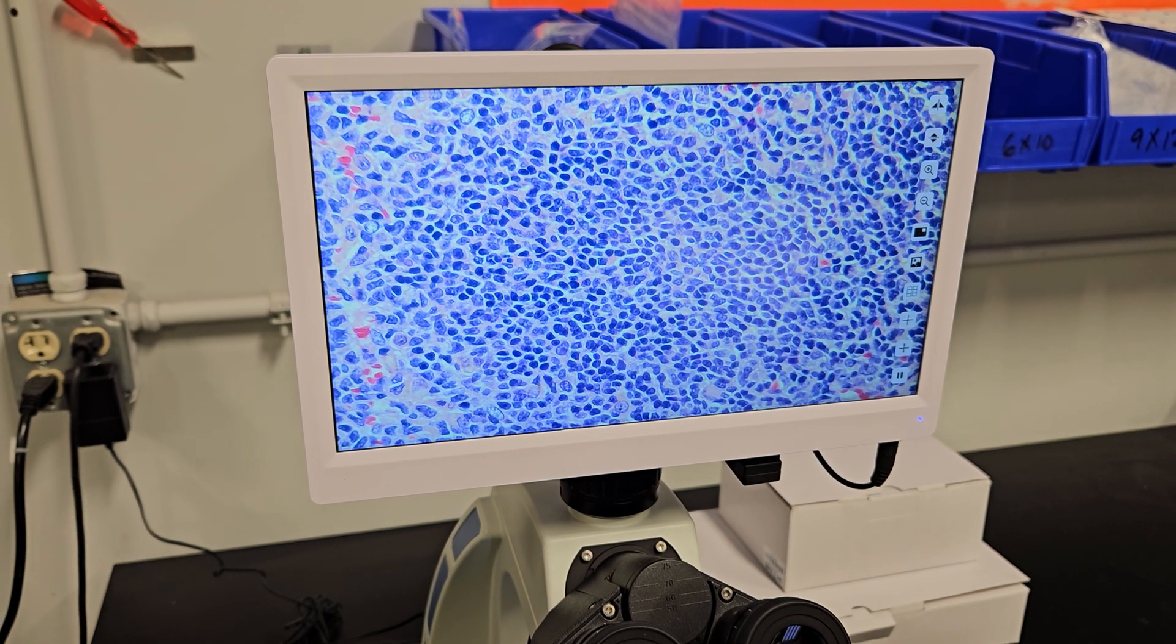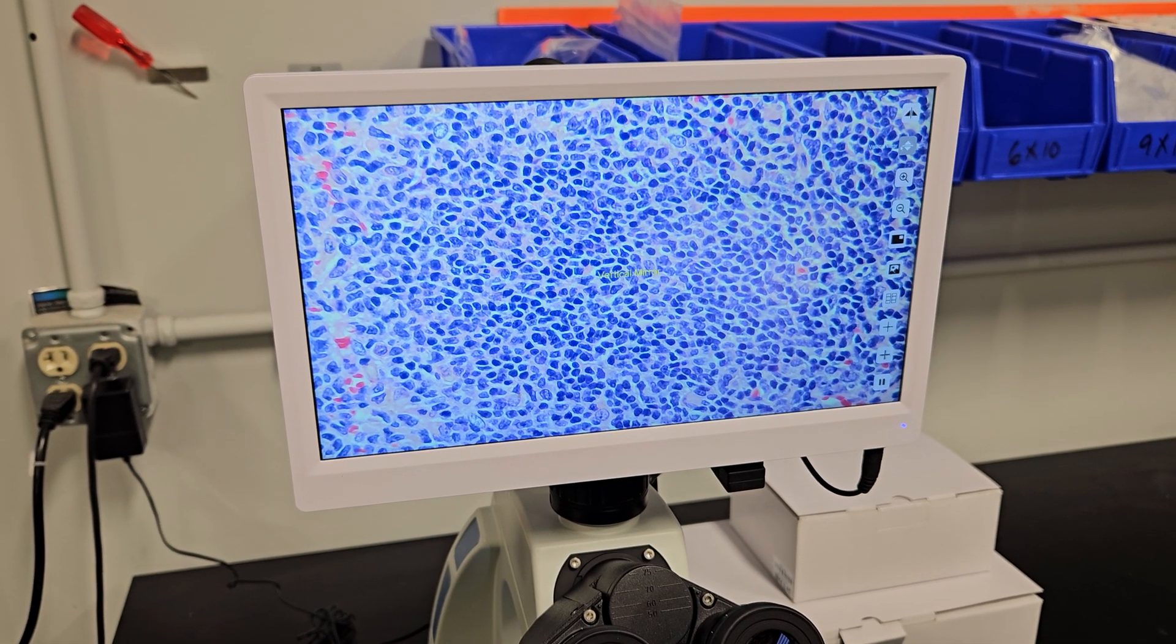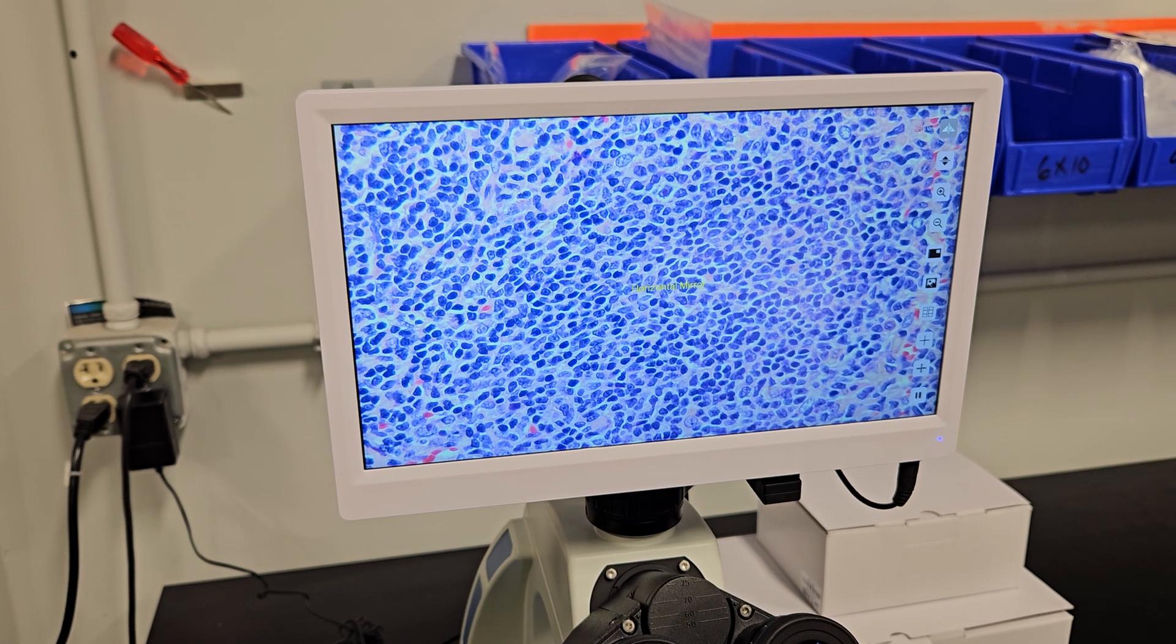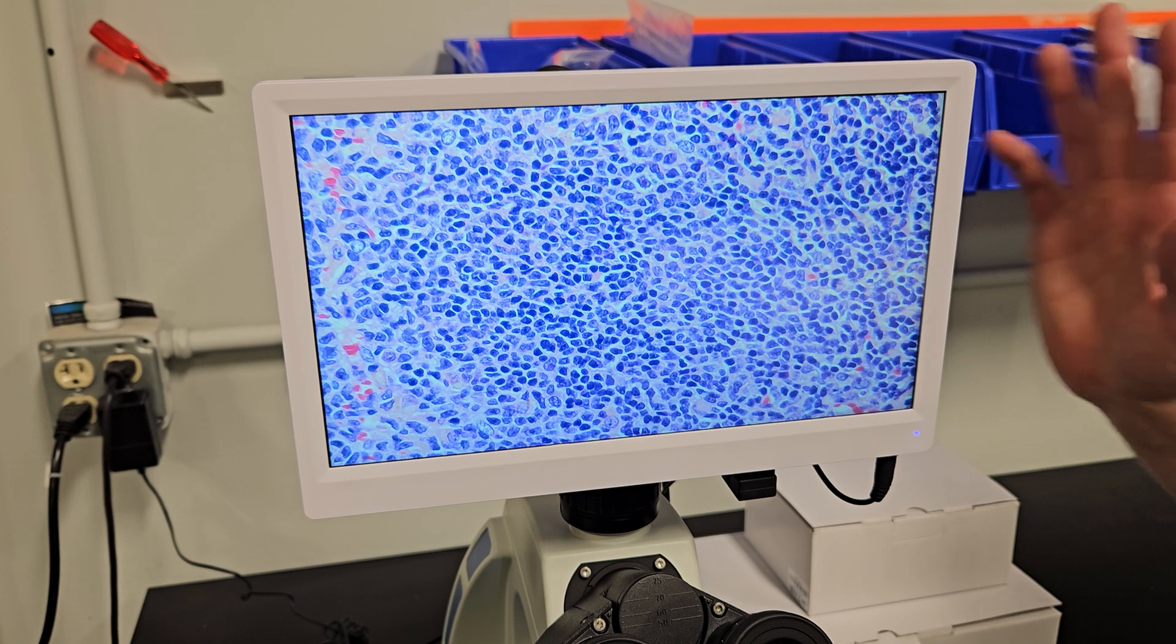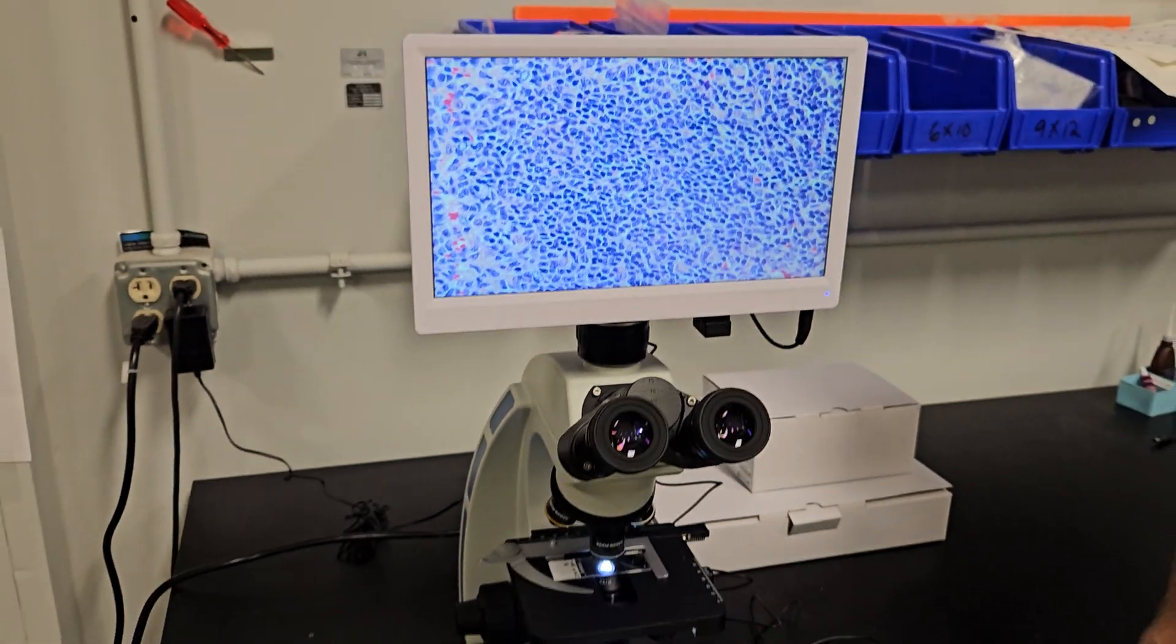You move over here to the right side of the screen. You can zoom in on the image, you can zoom out, you can flip the image, flip the image horizontally. There's a lot of little simplified versions but most folks are putting this on here for ease of view for folks that can't look through the microscope.